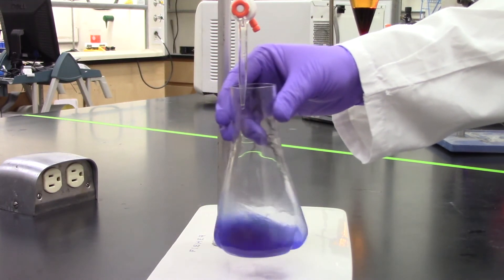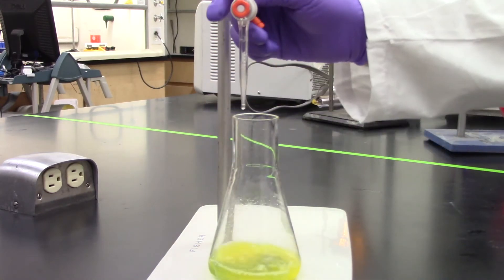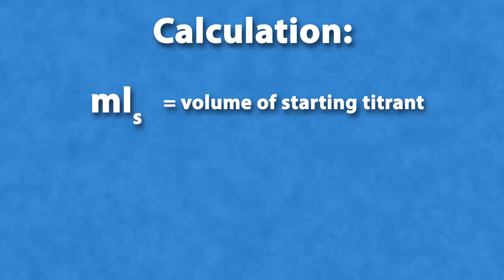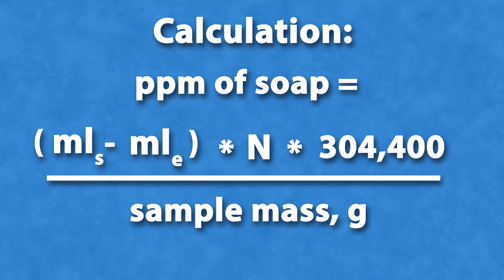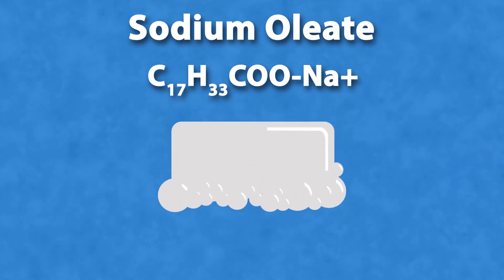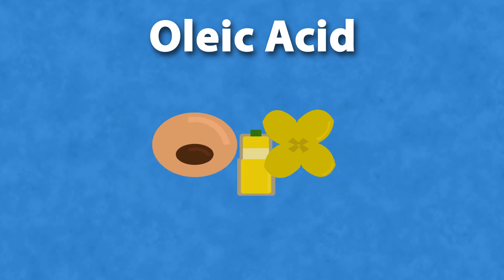This indicates that the pH is low enough that all the soap should have been split into free fatty acids and salt. Take note of the milliliters of titrant used. This gives the amount of soap as sodium oleate, with a molecular weight of 304.4 grams per mole. Oleic acid represents a good average molecular weight for soybean and canola oils.